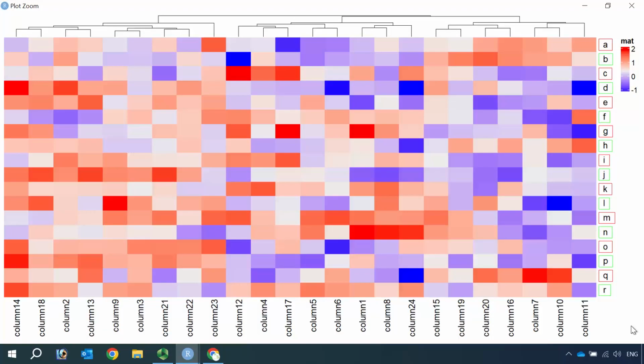Okay, I'm going to stop here for today's demonstration. You can see it is very easy to change all the settings and the labels, but you just need to know which arguments are available for you to change the settings.